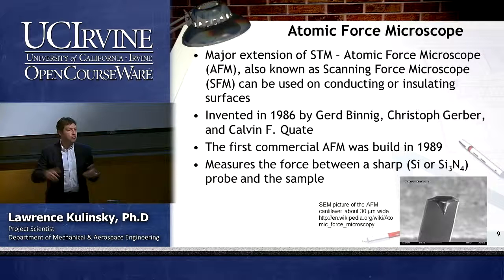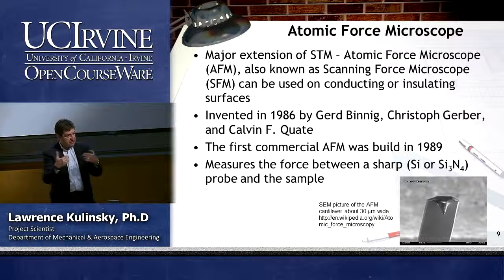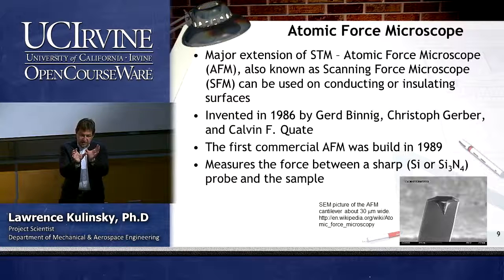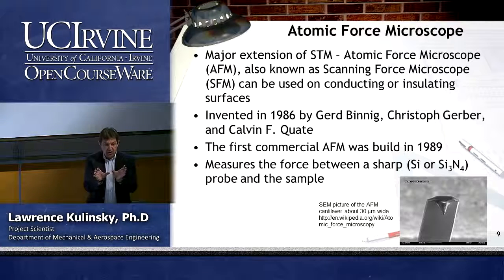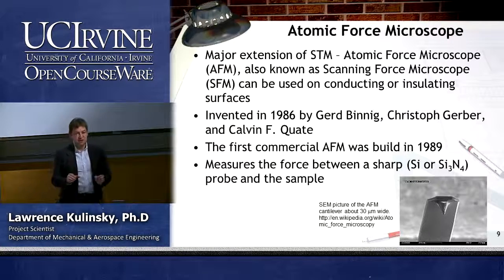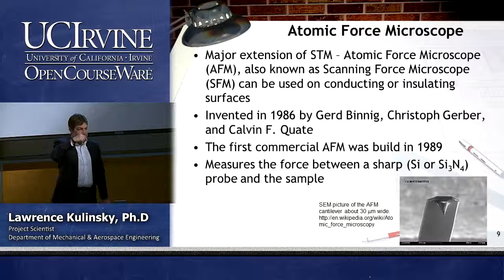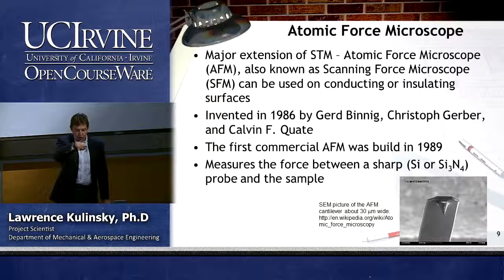They first thought it's van der Waals forces. Van der Waals is kind of polarization forces. If you have two molecules, they are polarized on each other, and you have basically an electrical force, which is the van der Waals force. But for AFM, the main force would be capillary force between the tip and the surface. And it basically goes and drags a pool of liquid around.